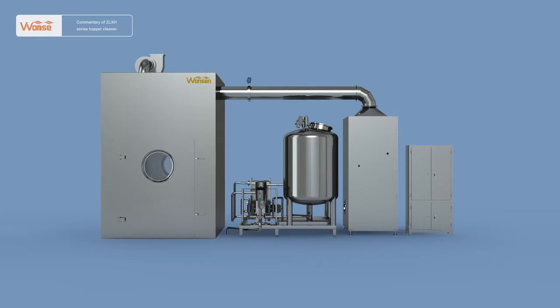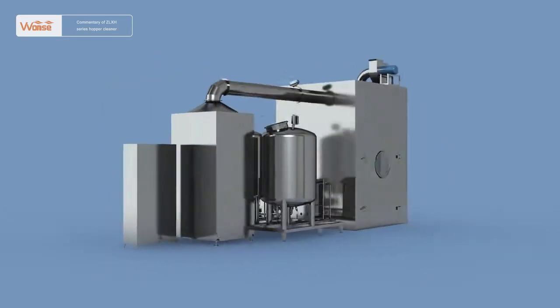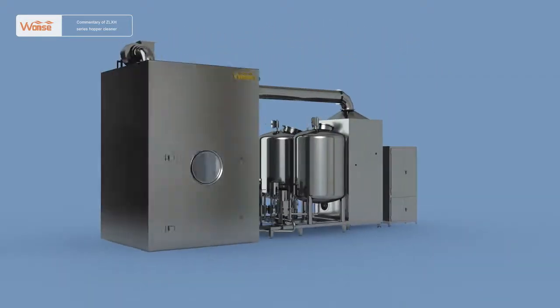In addition, while such features as large-scale and high diversification have shown in the use of hoppers, manual cleaning of hoppers cannot well meet actual production needs in modern pharmaceutical plants and GMP requirements. Therefore, our company has designed and developed the ZLXH-series automatic hopper cleaner.